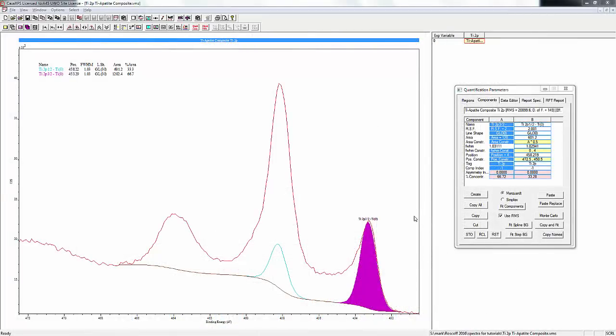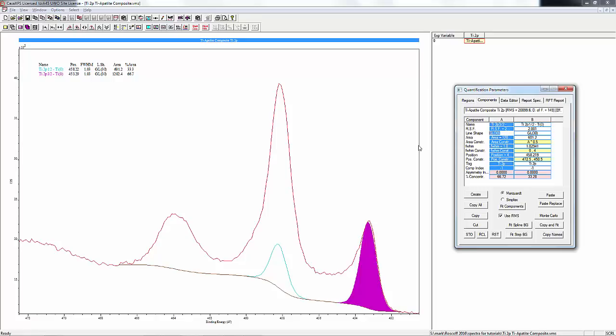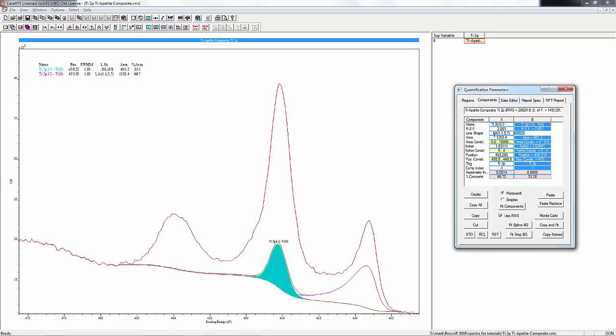So let's go ahead and put in those conditions that we just talked about. The line shape is going to be LA(1.1,5,7), and the same thing for the 1/2 peak.